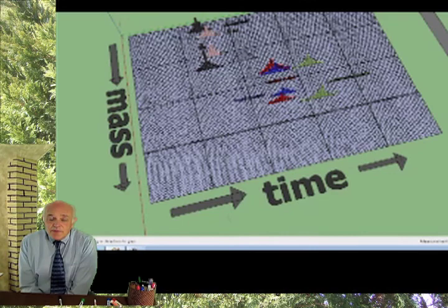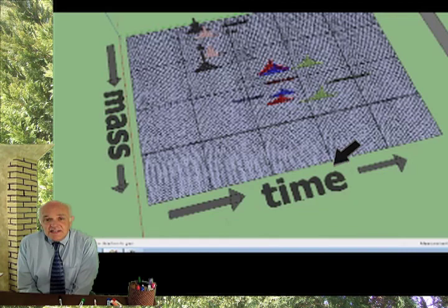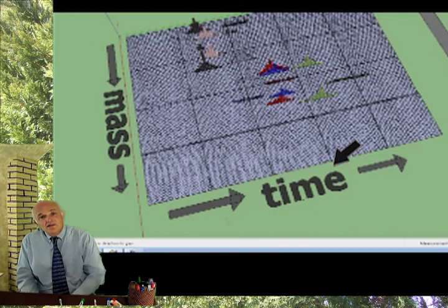This representation is about 1/800th of the size of a true mass spec 8270 analysis. The GC mass spec produces about a page of numbers every second. And there's about 3,000 seconds in 50 minutes, which is the 8270 run. So the 8270 produces a stack of papers about this tall, something like that. It's just a staggering amount of data.